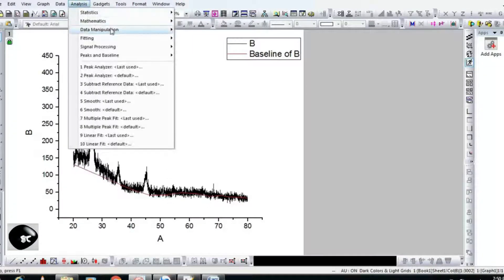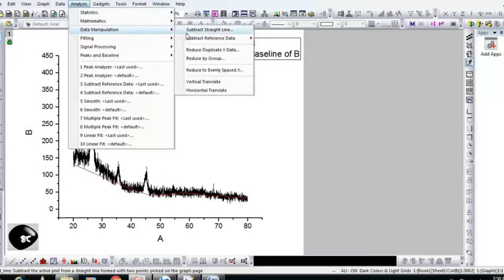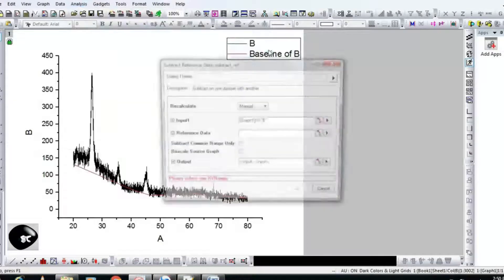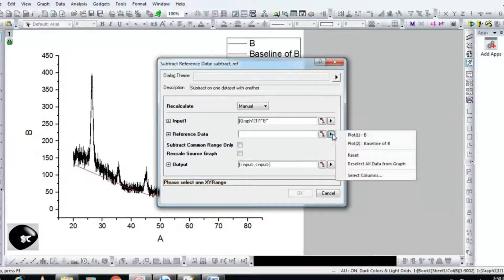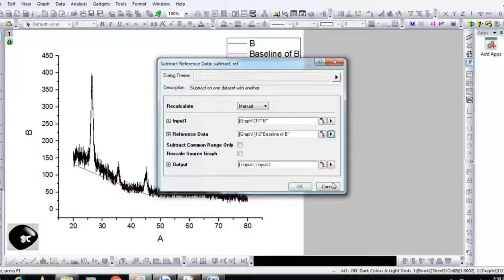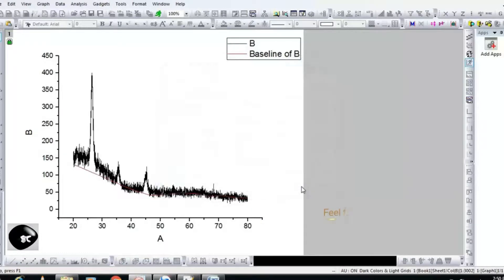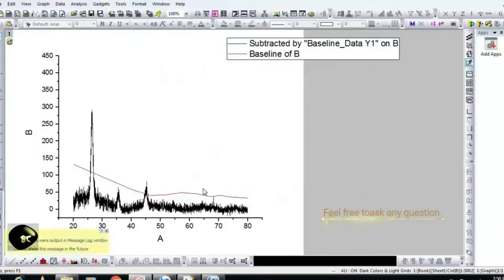Step 2: Go to Analysis, Data Manipulation, Subtract Reference Data. In the Subtract Reference Data pop-up menu, go to Reference Data, select 'Plot To', and hit OK. Now the baseline has been corrected.